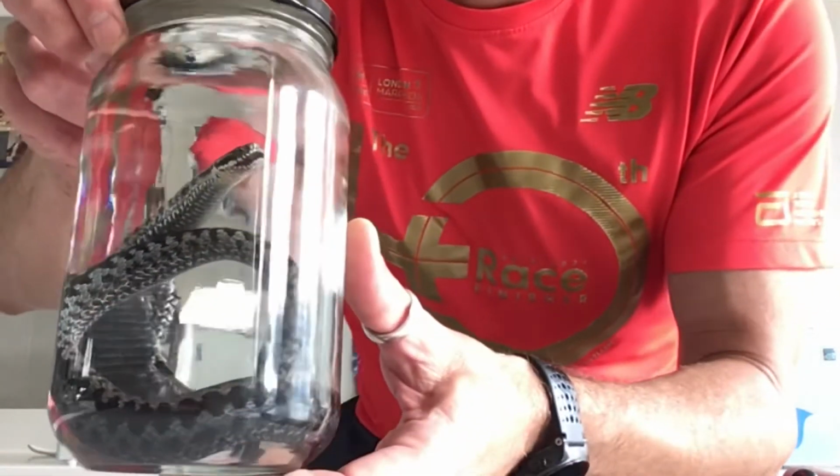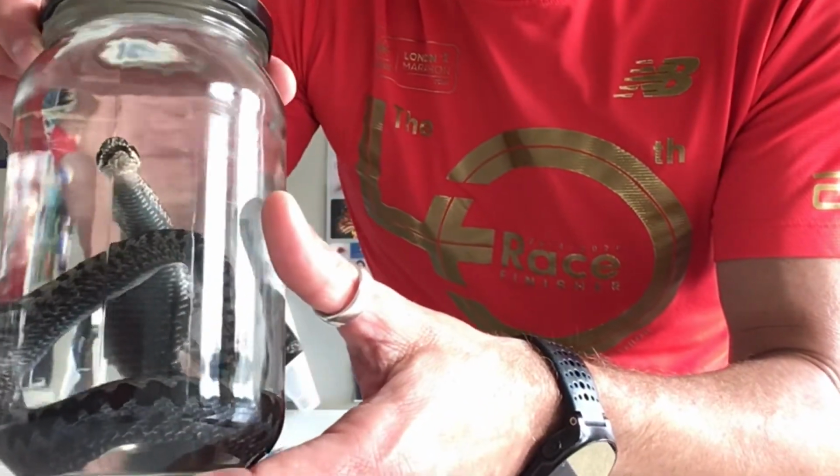Anyway, there we go. So he is a nice male adder, my first wet specimen, nice and crystal clear in the jar. One of the things you want to avoid is getting any bits floating around in the jar, and I managed to do that, to get it crystal clear.